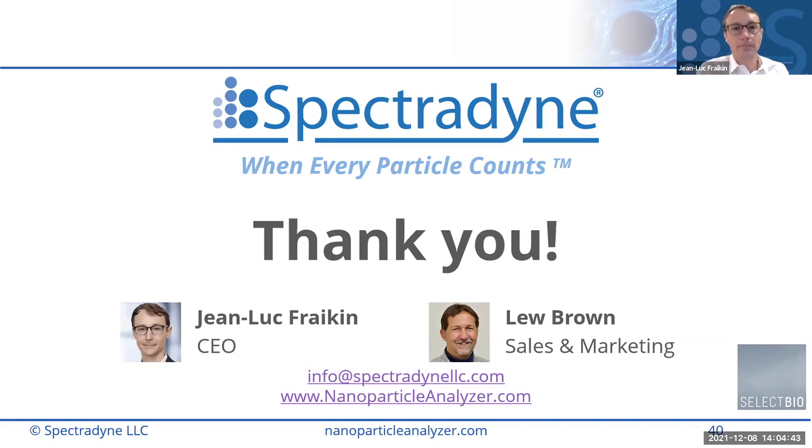I wanted to just jump in on Dr. Lopez's first question and just elaborate a little bit, because I saw one of the other questions that was along the same lines, and basically it's what happens with particles that are below that limit of detection. And the quick answer is, if you remember Jean-Luc's slide, which showed the graph of the particle coming in and the change in voltage, et cetera, there is a background noise level that's always there from the electronics.